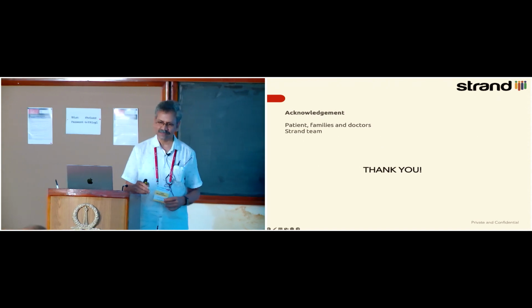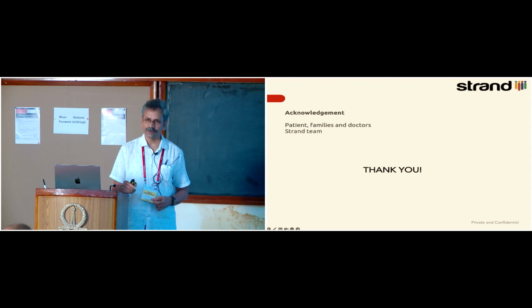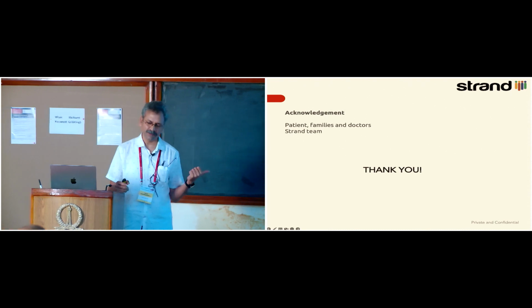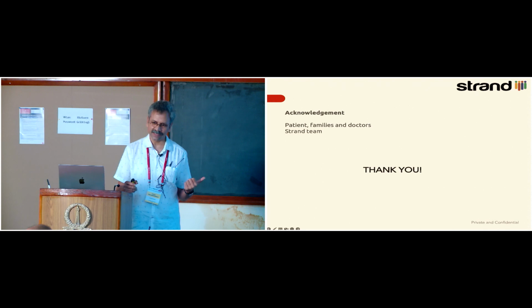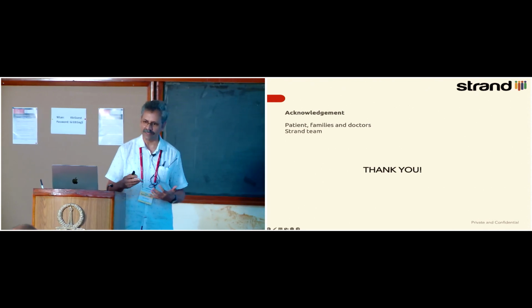But can this consideration be ignored if I'm having long reads? If you're having long reads, most probably you could ignore some of these things. But just the way that we are familiar with GC bias and a lot of other things that happen in short read sequencing, I'm not familiar enough with long read sequencing to know what biases might be there.